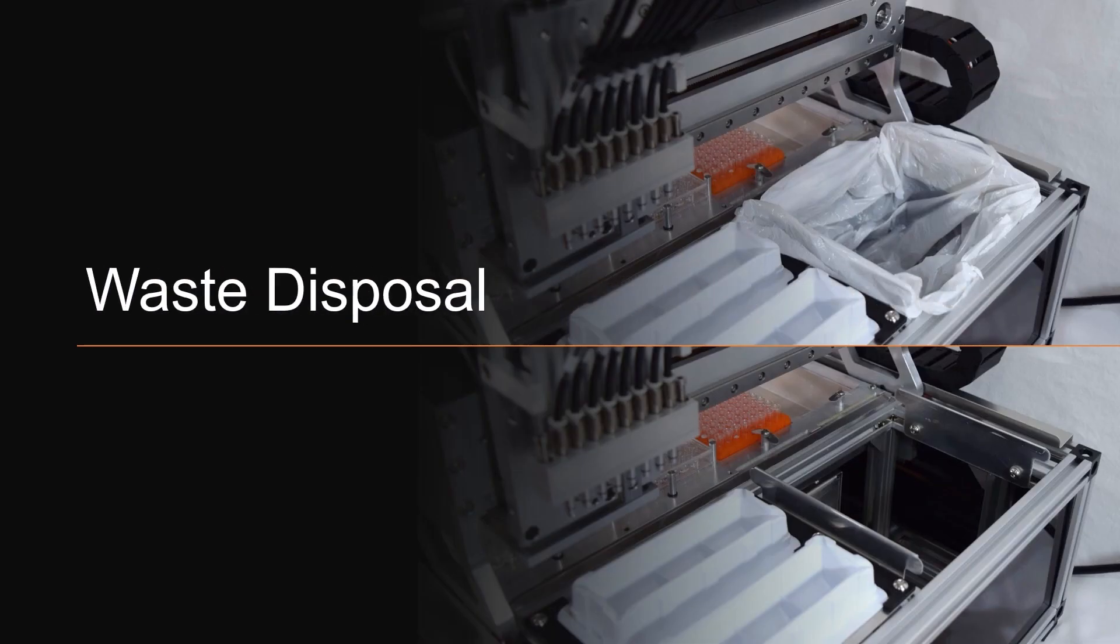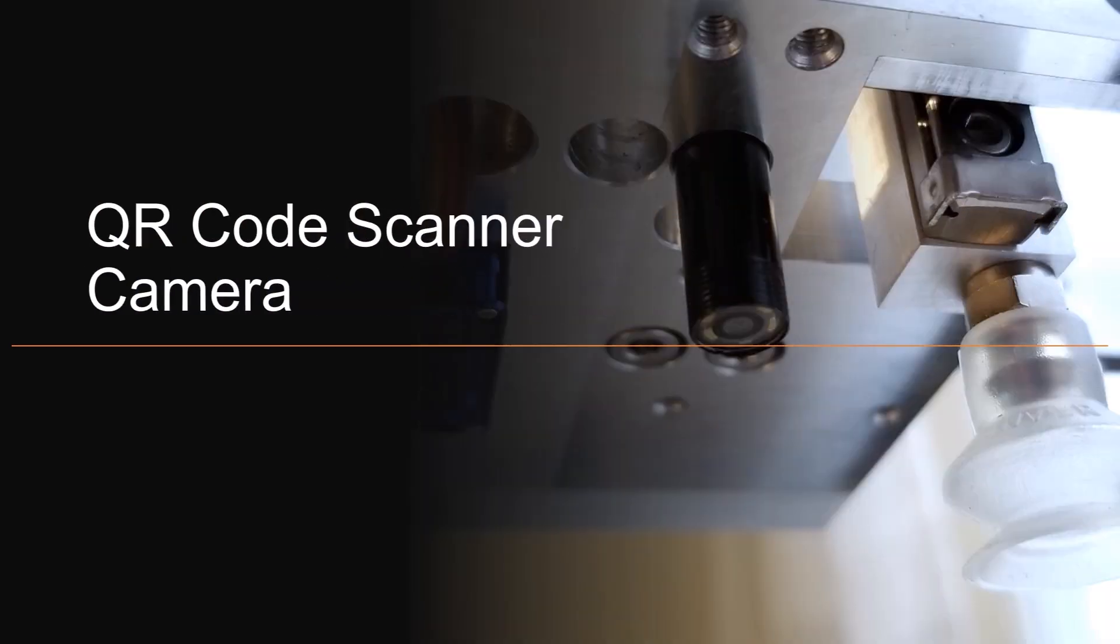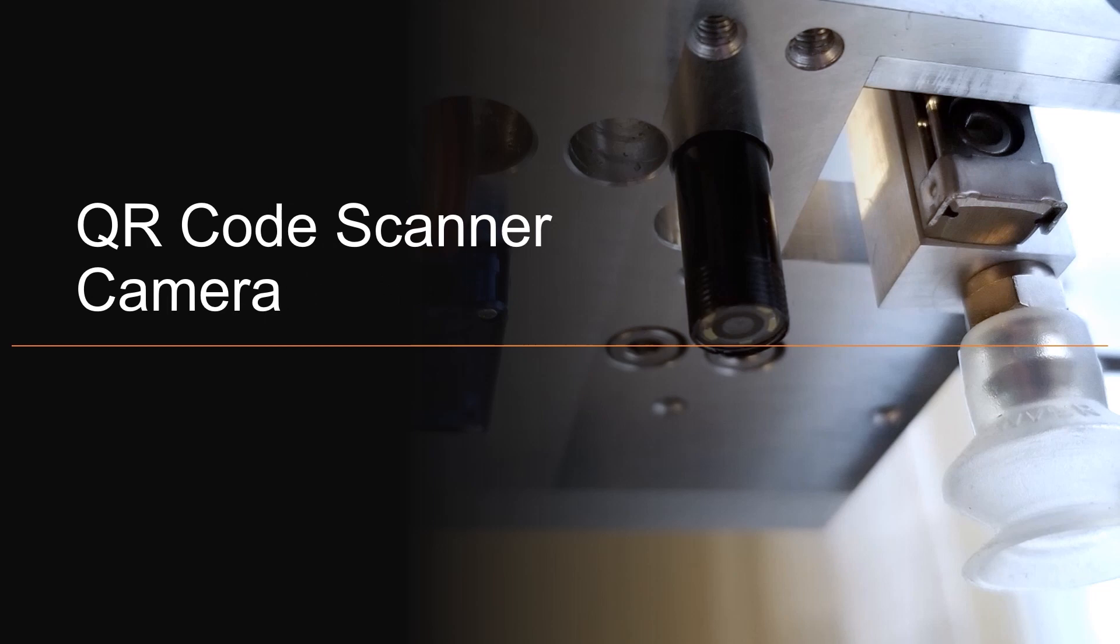Tips are disposed into a bag at the front of the machine. The bag is held in place by stretching it over a set of tabs. The trays are identified via a QR code on the lid which is read using a camera mounted to the head of the machine. The camera is fully functional, however the software to scan and record the codes is not yet complete.